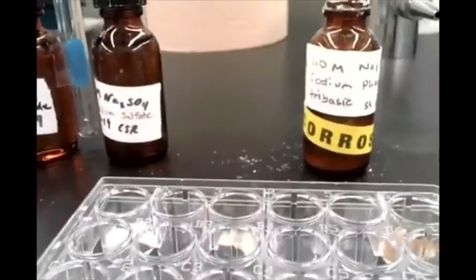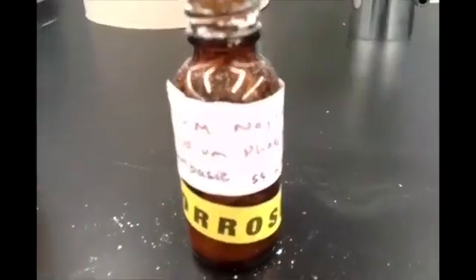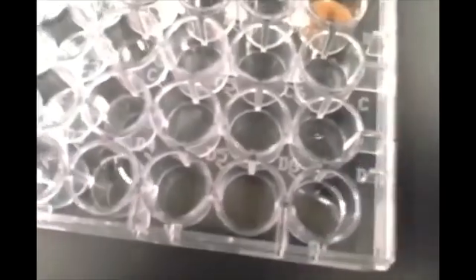Alright, so hopefully you'll be able to tell whether or not a precipitate formed. And for our last trial, we're going to take our calcium nitrate and add a few drops of sodium phosphate to that. Okay, so let's go ahead and do that now. Okay, we'll add that to this last cell over here.